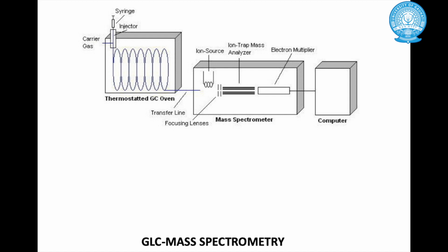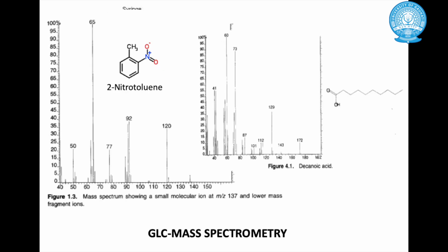Here the ions are directed to hit a detector which is going to amplify the signal corresponding to the ion which is coming.